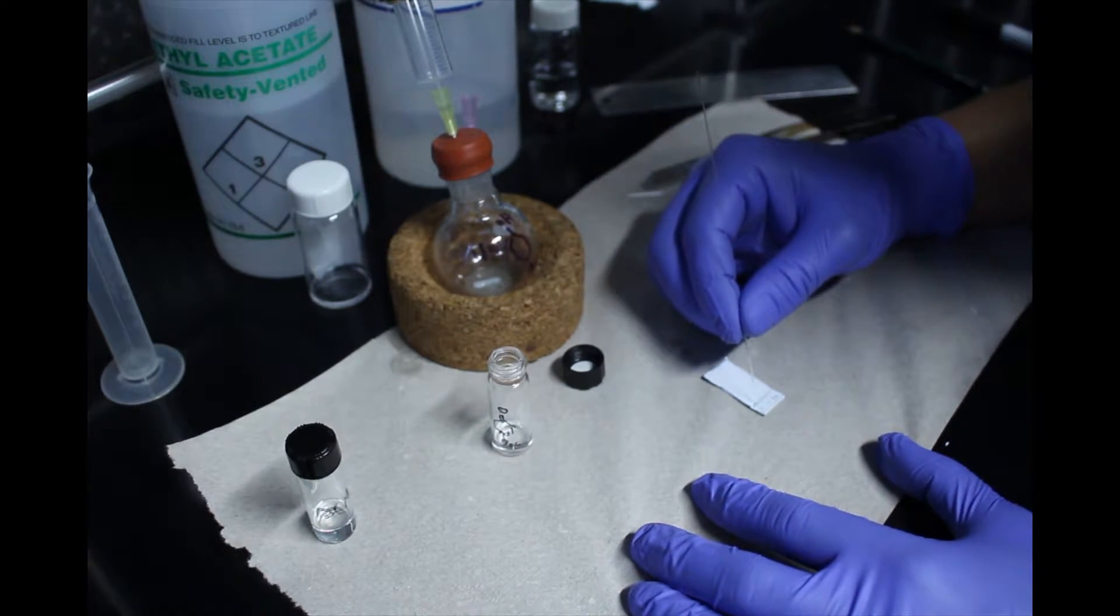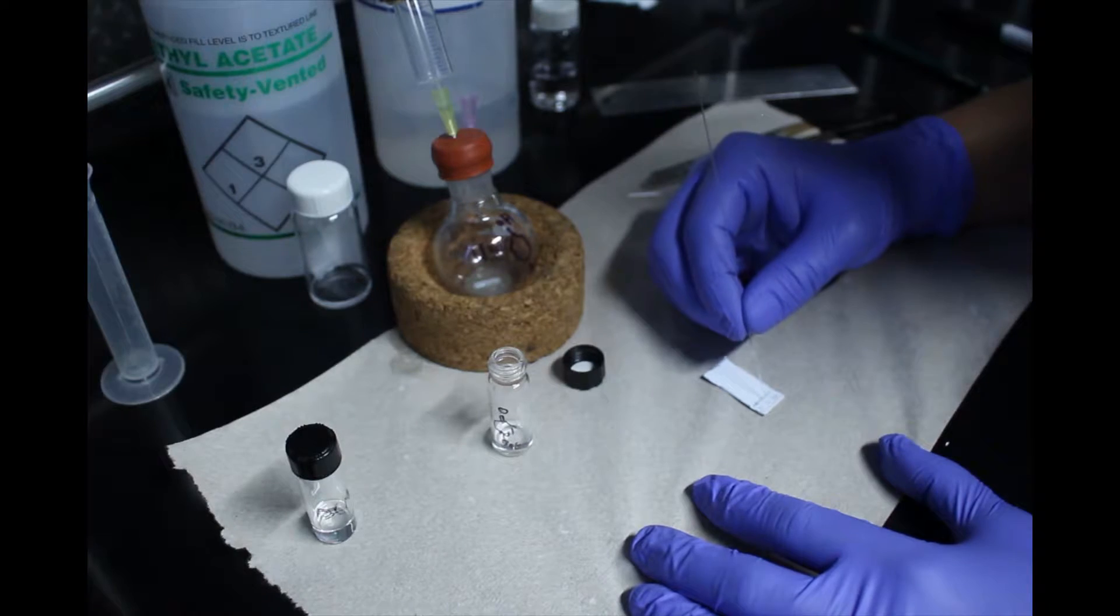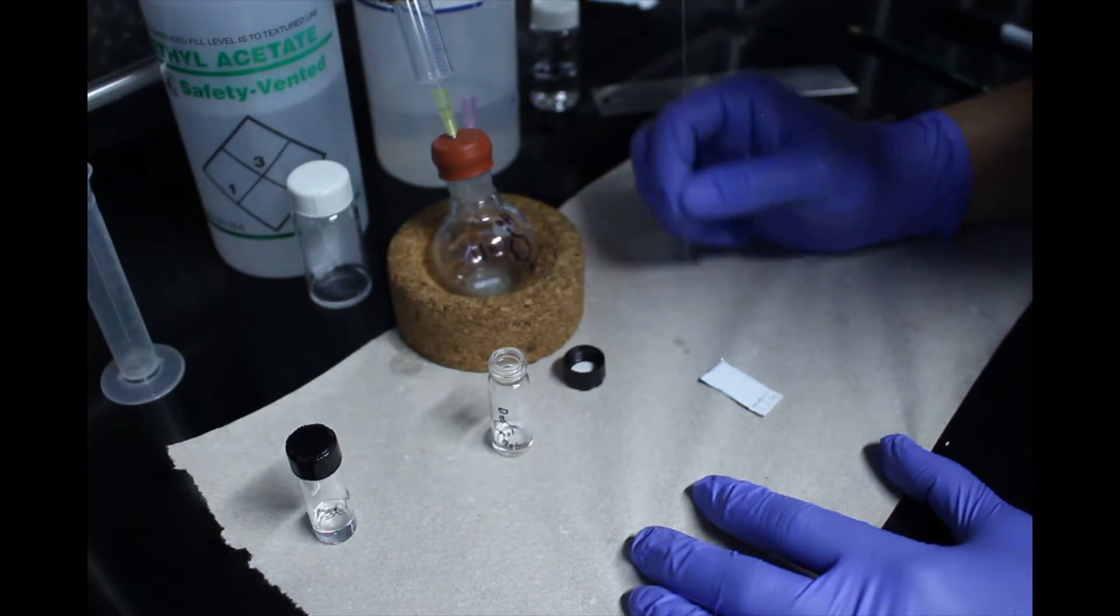Spot your starting material on the first two lanes using a spotter. Rinse the capillary tube in a small vial filled with dichloromethane and remove the rinse by spotting onto a paper towel.